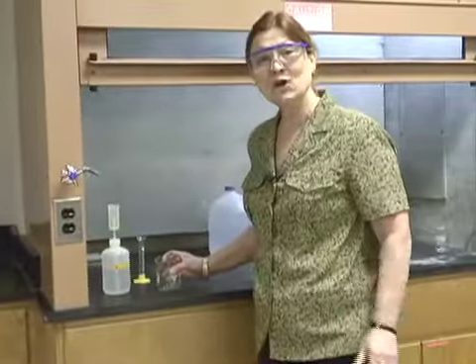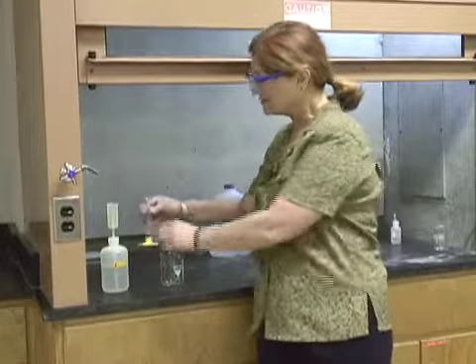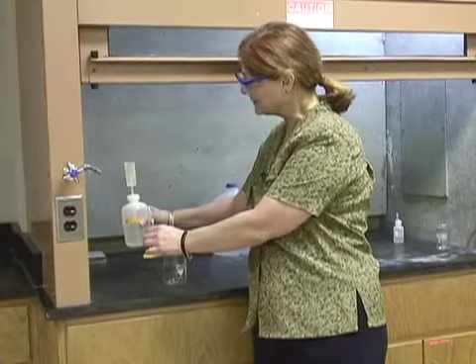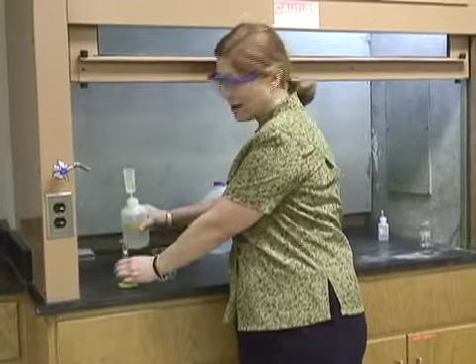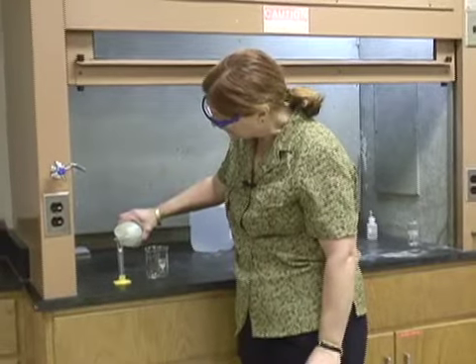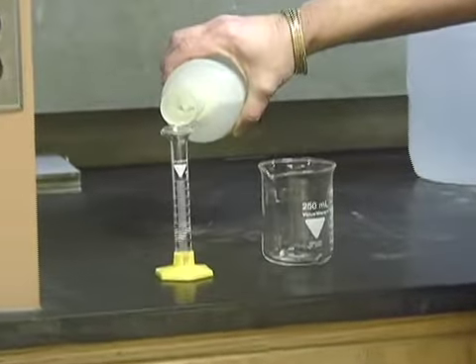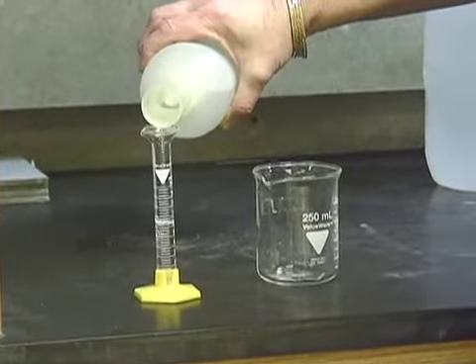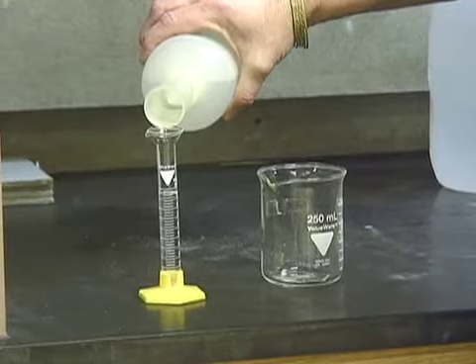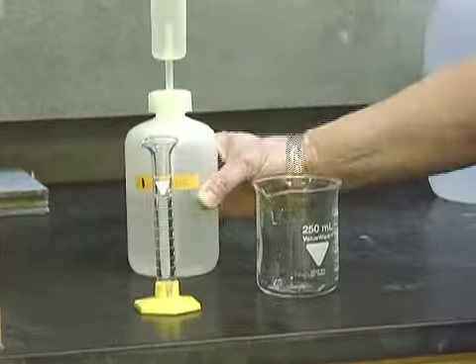Now, I'm in the hood, and I'm going to measure out 10 milliliters of 1 molar hydrochloric acid. And this is a graduated cylinder, and I will measure out 10 milliliters. Now, this part doesn't have to be extremely accurate, but it's always good to try to be as accurate as possible.